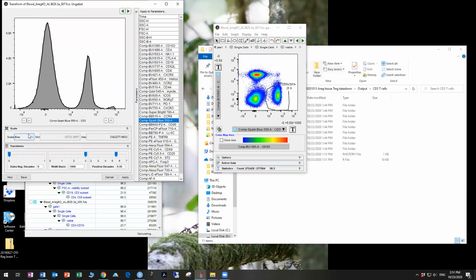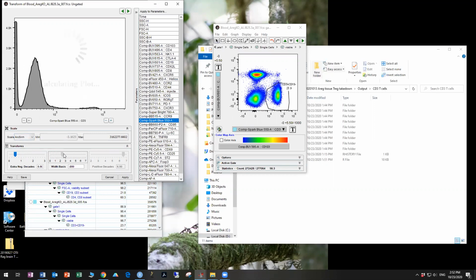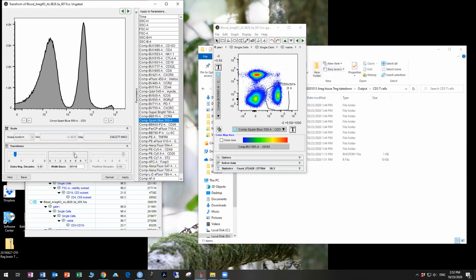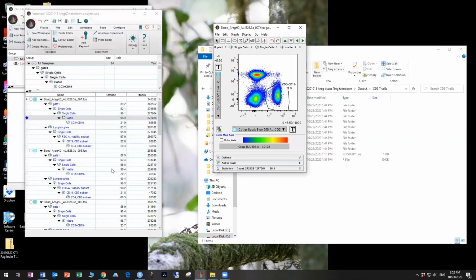So if we open this up again, you can see that the default in FlowJo is a bi-exponential scaling of the data. What we're going to use in R is this hyperbolic arc sine transform that looks something like this instead. And you can see that this is actually quite different. And we can change the amount of compression by playing here. You can see that depending on how you plot this, the data really looks quite different. And so we're going to be modifying those parameters in R in order to make the data look in a manner that more or less matches what we see here.